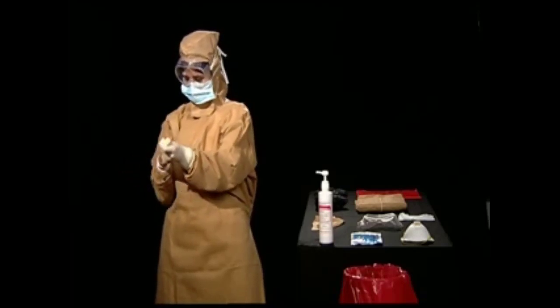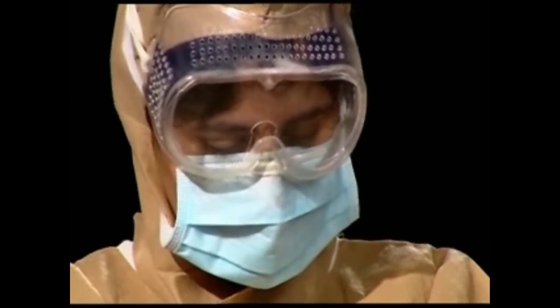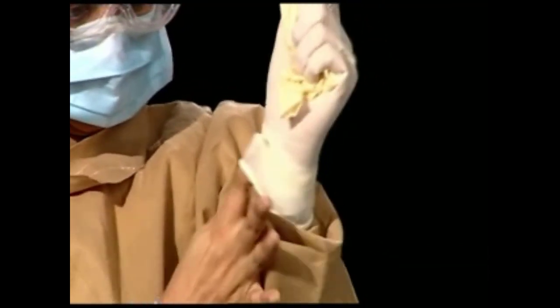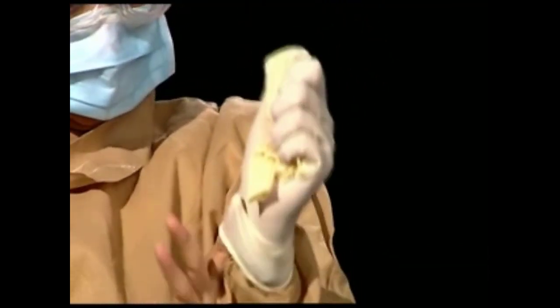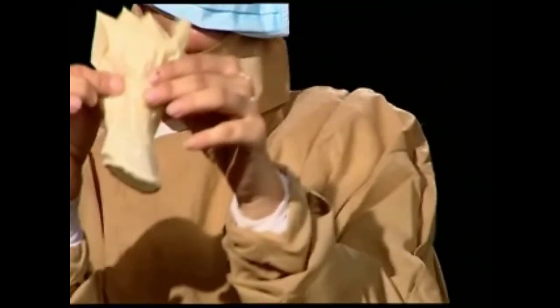Slide the index finger of the free hand underneath the second glove and roll it inside out over the already free glove. This way, the hands would not come in contact with the contaminated surface of the PPE. Once the gloves are off, they must immediately be thrown into the biohazard bag.